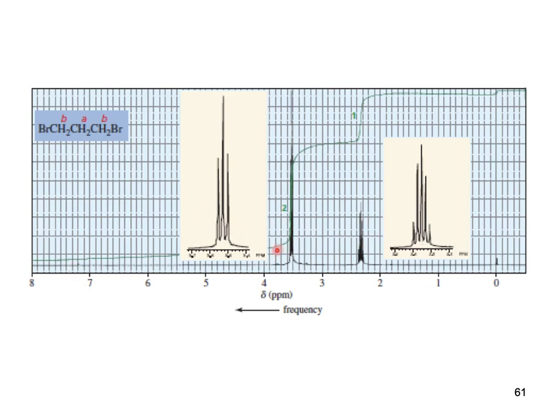So that's how you have to explain how many signals appear, and why they have different chemical shifts. In this case the bromo is attached, meaning a highly electronegative element is attached, that's why the protons appear in the de-shielded region. And this one proton is a bit more shielded as compared to the CH2 proton which is attached with the bromide.